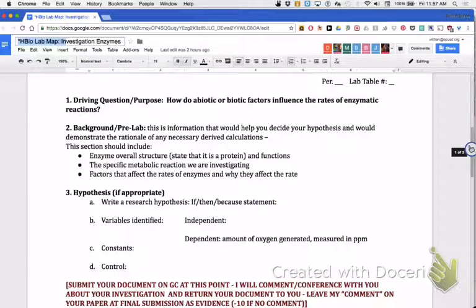Now, when you run these, your runs usually last, most students do about 3-minute runs, and you might do three 3-minute runs or three 5-minute runs at most. So you will have your control, and then your independent variable, you can do 2 different things, like 2 different pHs or 2 different temperatures, 2 different concentrations, whatever it is that you're going to change, okay?